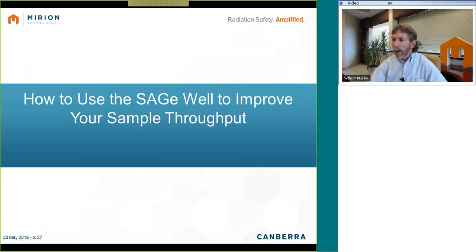So let's say we want to measure some common radioactive materials in samples, such as radium-226 or 228 in water. I know that's a fairly popular topic these days. There are lots of ways to do this that result in varying degrees of confidence in the results, and that confidence is variable dependent on how much data we get from our analytical method, which is largely dependent on efficiency. So I'm going to use efficiency as the basis for describing some sequential improvements using radium measurements as an example.